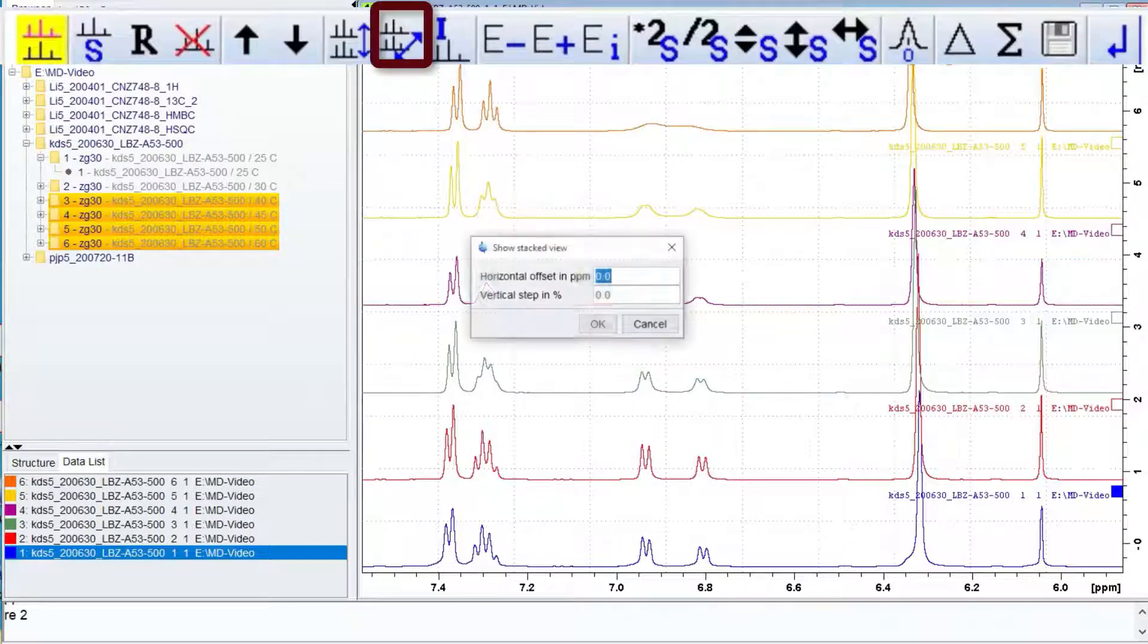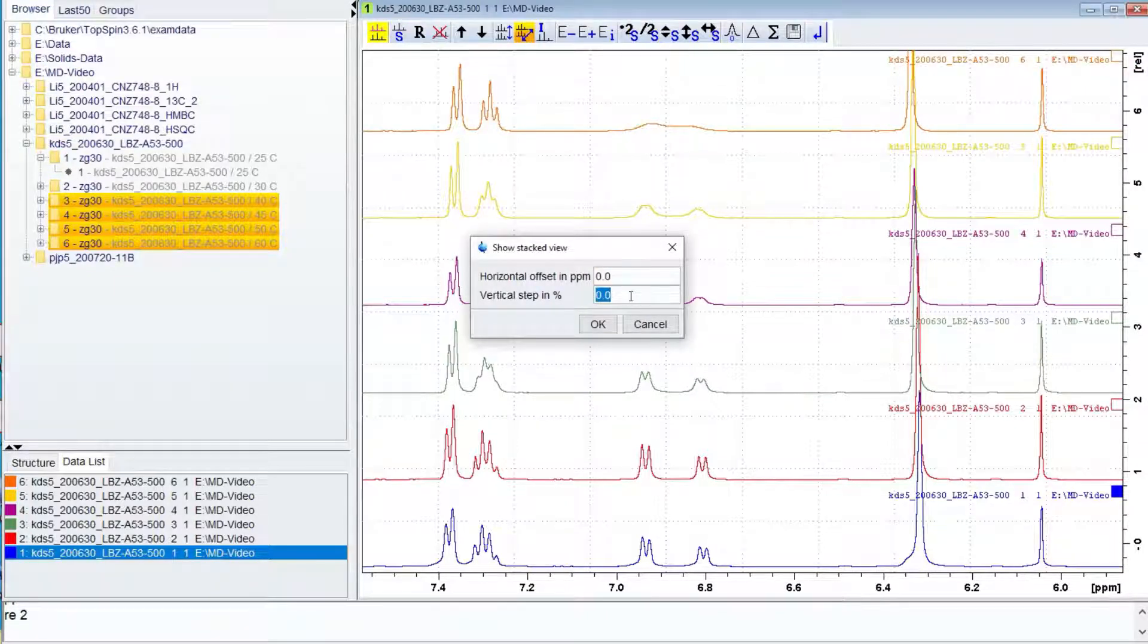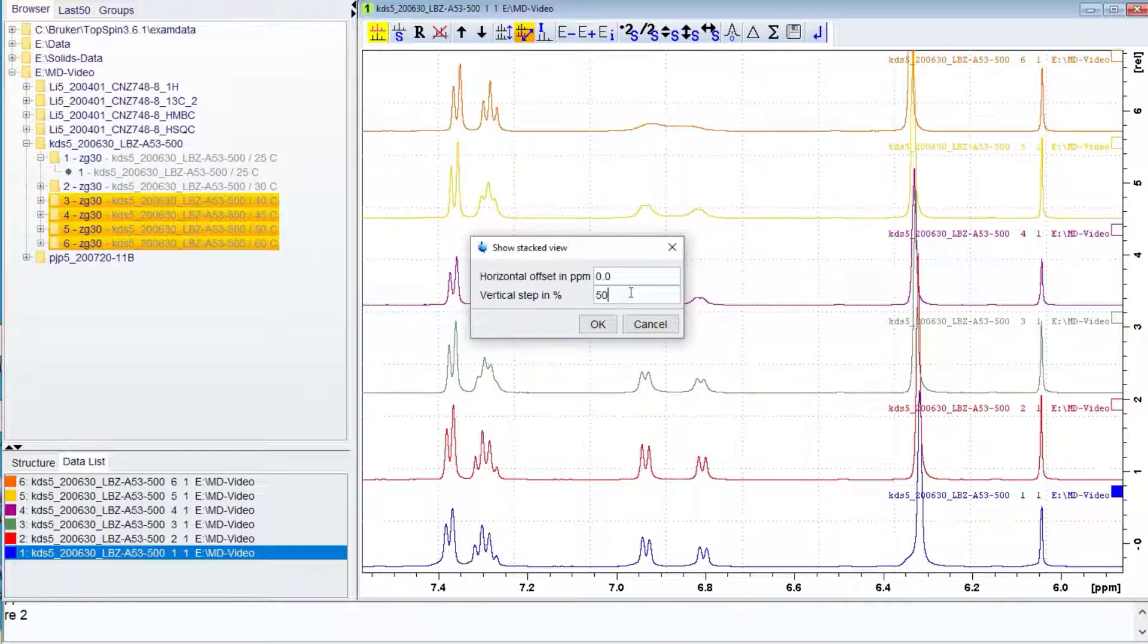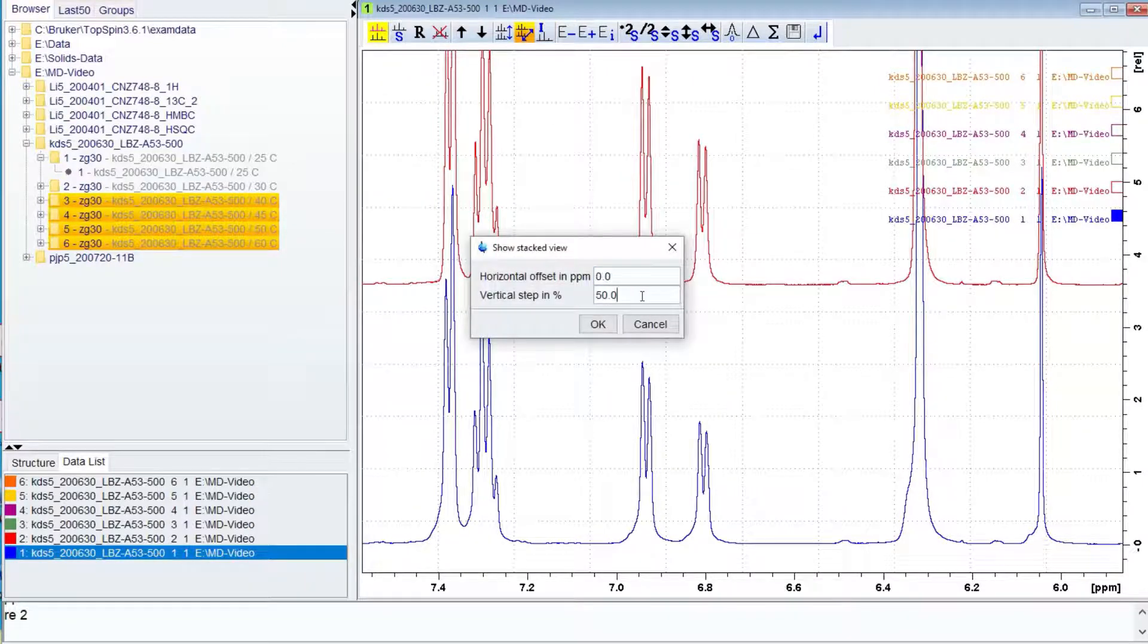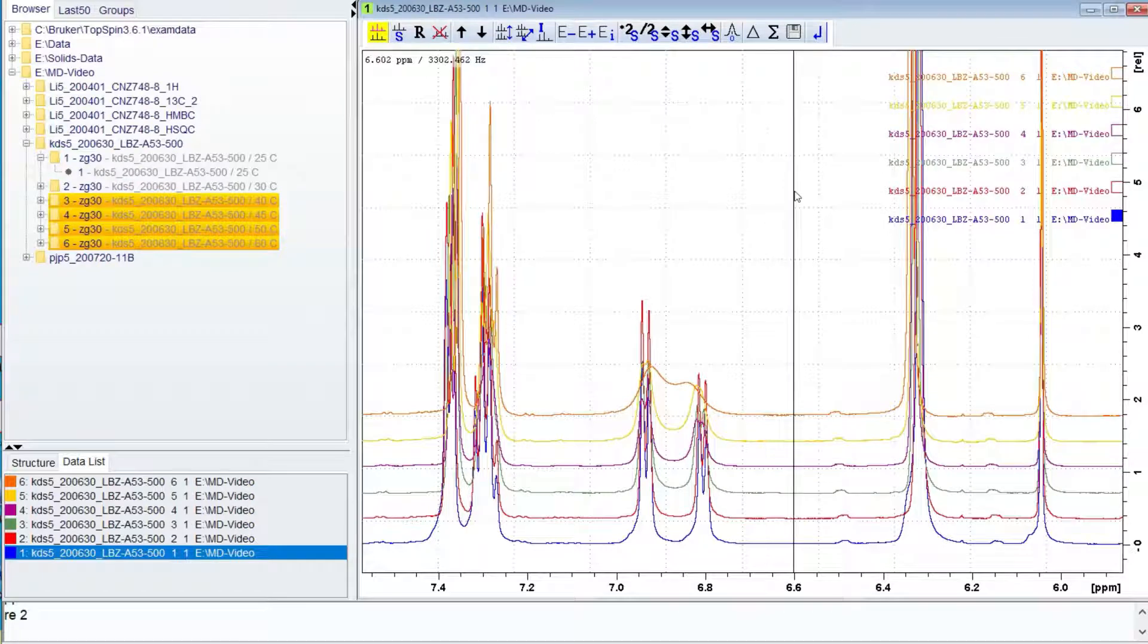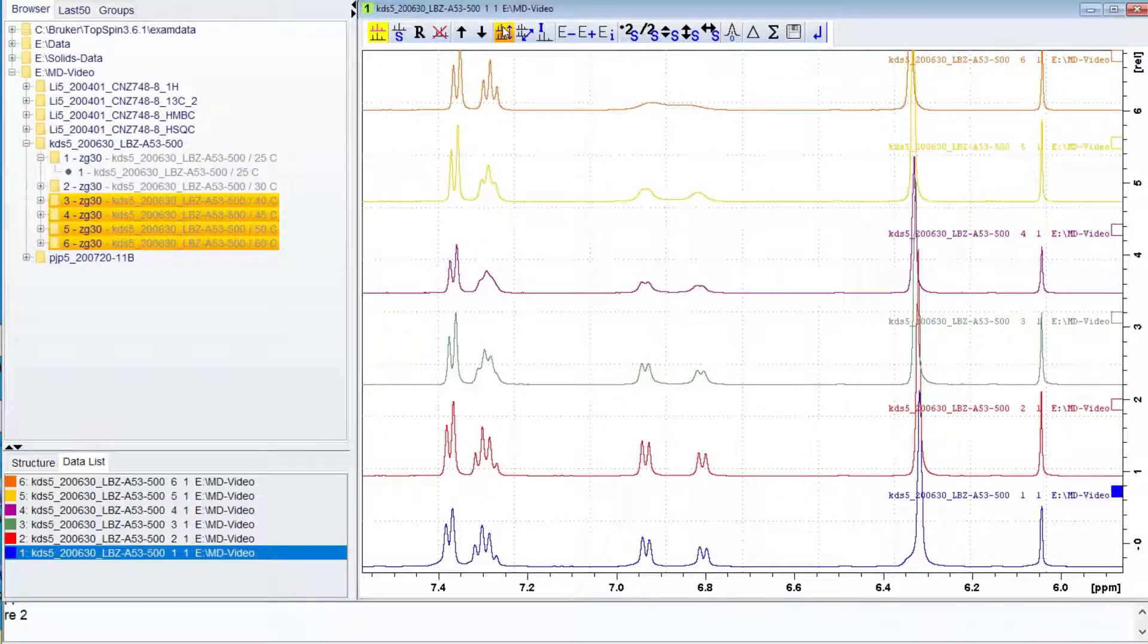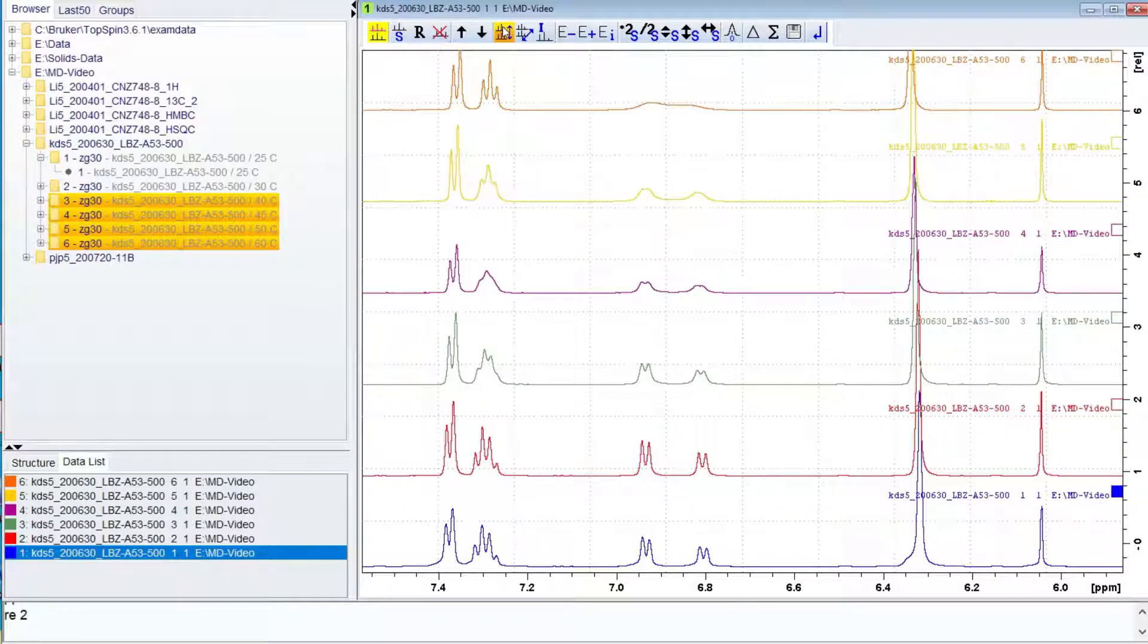The show stacked view button will allow you to fine-tune the offsets in both the vertical and horizontal directions. Most of the time you will leave the horizontal offset to zero so the chemical shifts will remain aligned. The vertical step is in percent and it will allow you to move traces out of the window, so you have to choose values that give you the offset you require but does not eliminate any data sets. When values are entered into the stacked view, the toggle display button will switch the offsets to either the default or those entered.